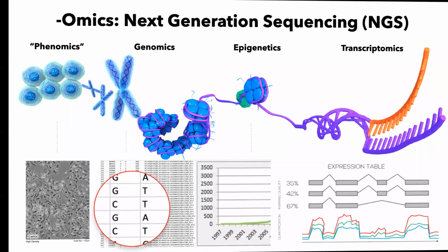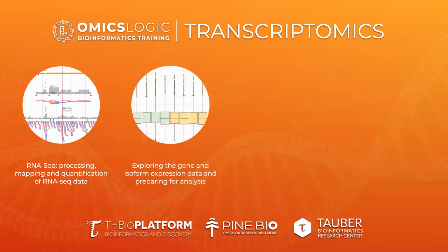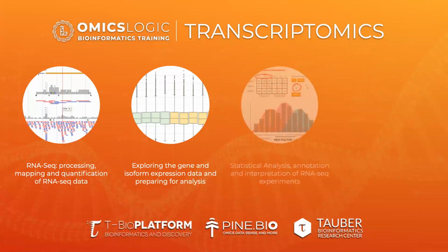So what we'll do in this program is we'll talk about some of the basics of RNA-seq, how processing, mapping, and quantification of RNA-seq data, how to explore the gene and isoform expression data, and how to prepare the data for analysis, what type of normalization techniques and data pre-processing techniques make an impact on our ability to interpret what is going on at the subcellular level.